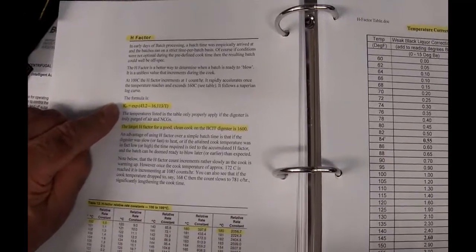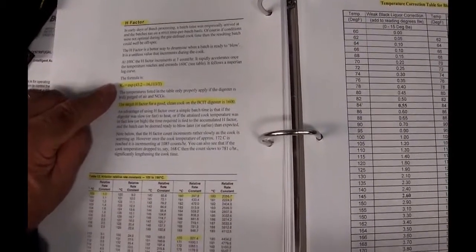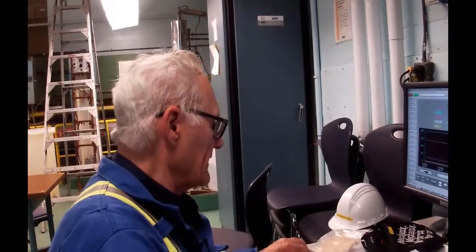And pulping, the actual manufacture, the production of pulp is actually a natural process. If a tree falls over on the forest floor, in 10 years, it's going to look like that. It's going to be a bunch of pulp. It's just going to be mush. So what we do is we speed it up. We increase the temperature. Anytime you want to cook something, you raise the temperature. And then we also applied some chemicals, sodium hydroxide, sodium sulfide. The sulfide goes in and dissolves the lignins that are holding that piece of wood together.